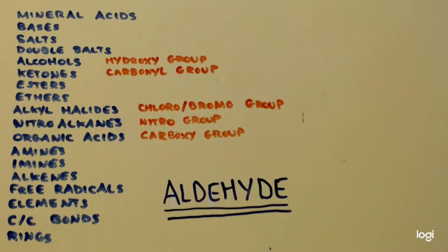You know, but see, the thing is all of those oxidizers are based on chromium. They're based on chromate, you know, dichromate, whatever you want to call it, chromic acid. They're all based on that same thing. And for me to make that from scratch, I can only make about 20 grams at a time, and it takes like the whole day. And the molar mass is so big that 20 grams is nothing. You need 250, 300, I don't know what the molar mass is, but you need a lot of it. And that's just to make the dichromate.